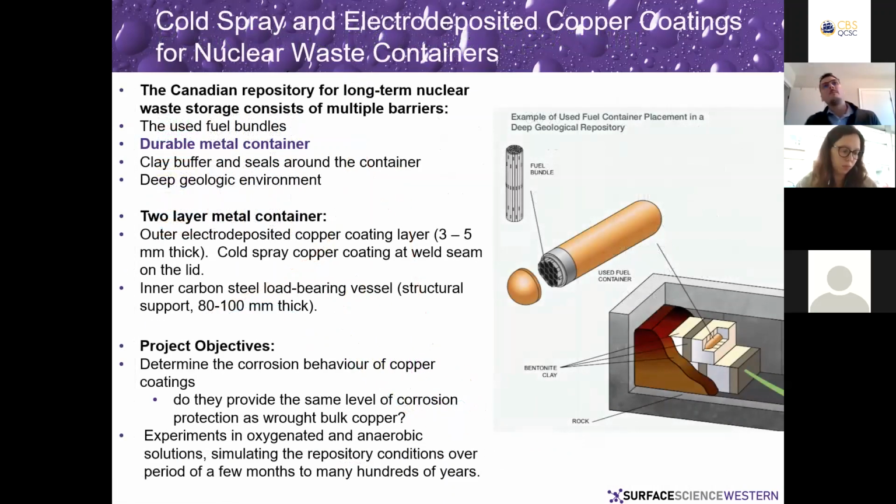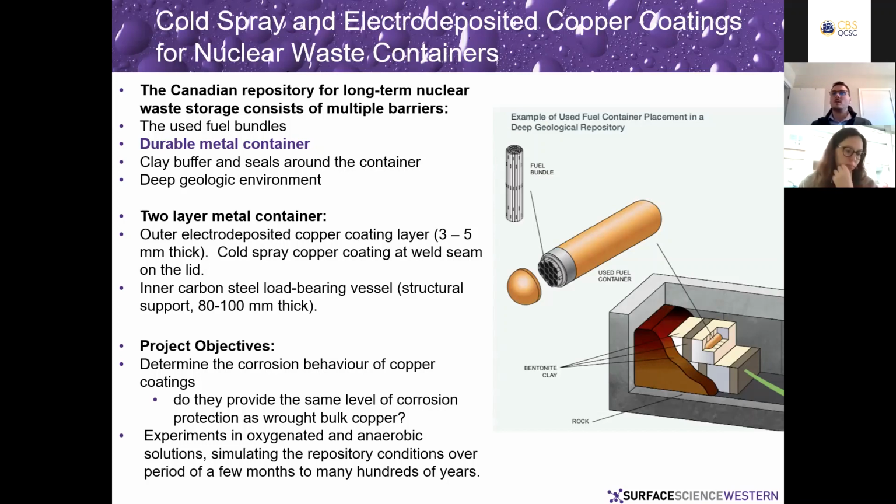Some of the reasons we're looking at copper so much right now is we've been working with the Nuclear Waste Management Organization over the last 15, 20 years now. They're looking to bury spent nuclear fuel underground for the next, hopefully, 1 million years without it leaking out. And so they're building these steel containers that are clad in copper. And copper can stick around in the environment in its native form for a long, long time. And so we're doing a lot of electrochemistry and surface analysis on copper. That's why we're looking at copper.